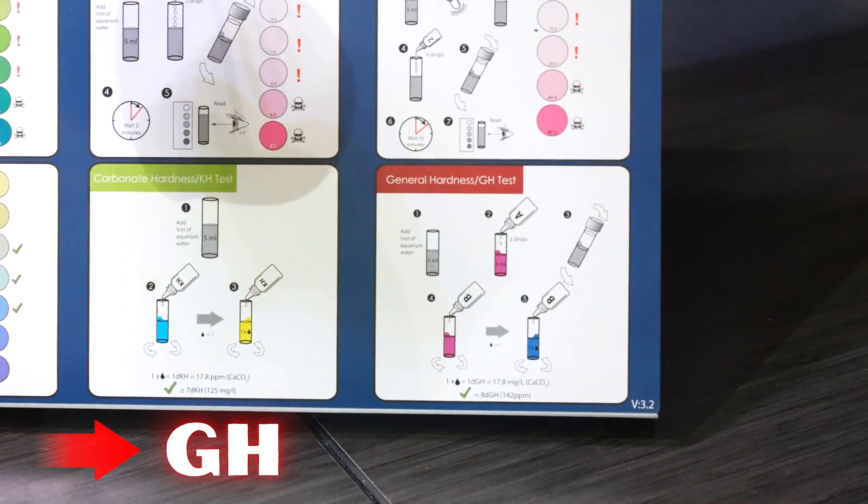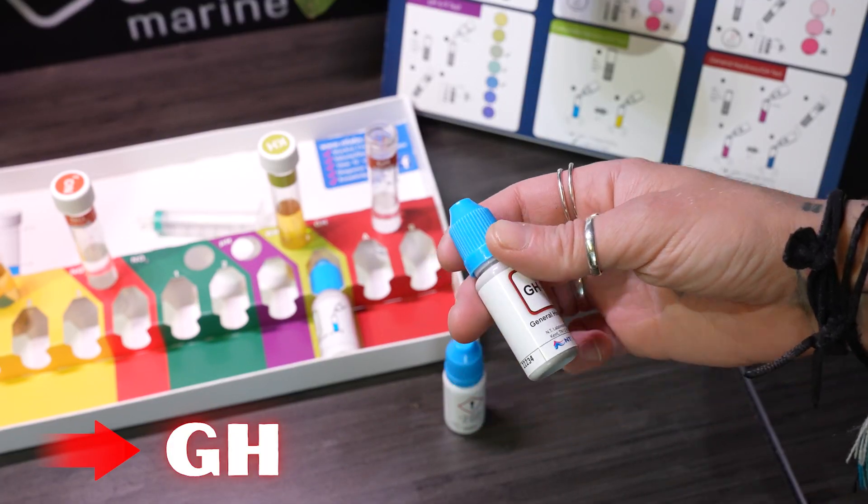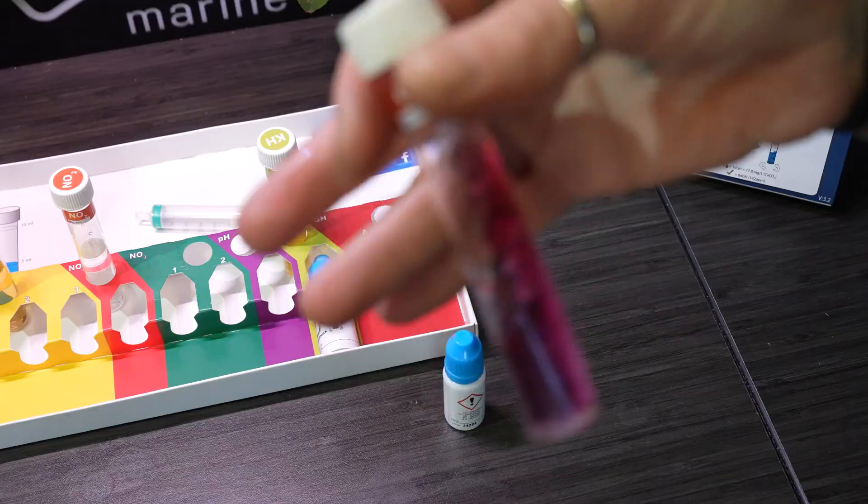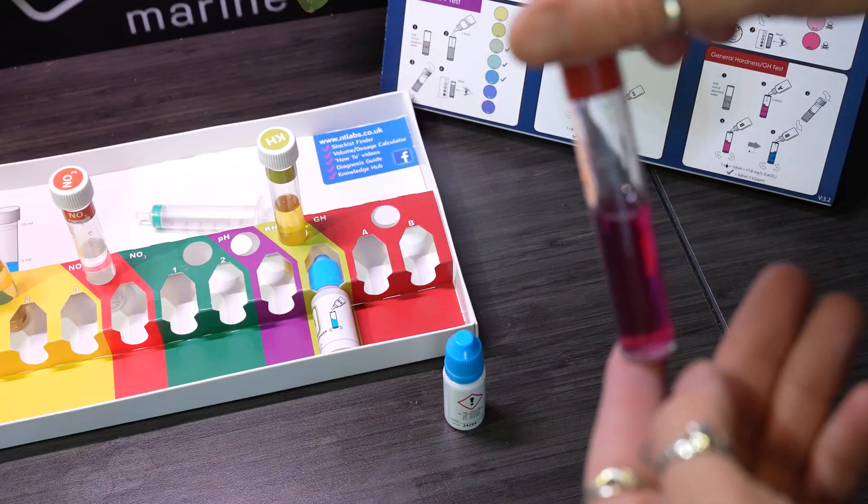Next up, GH, or general hardness. Water lies on a spectrum between soft water and hard water, depending on the amount of dissolved minerals. The more minerals, the greater the hardness.